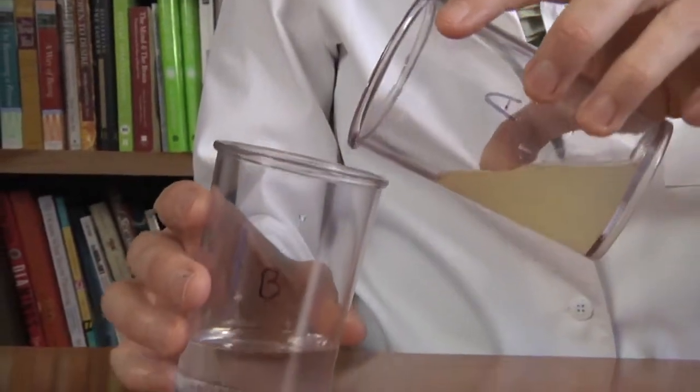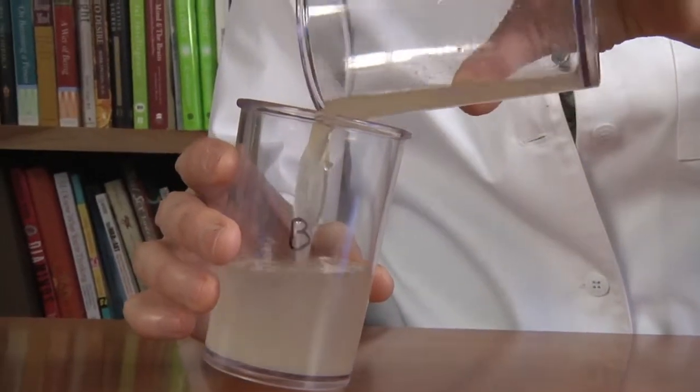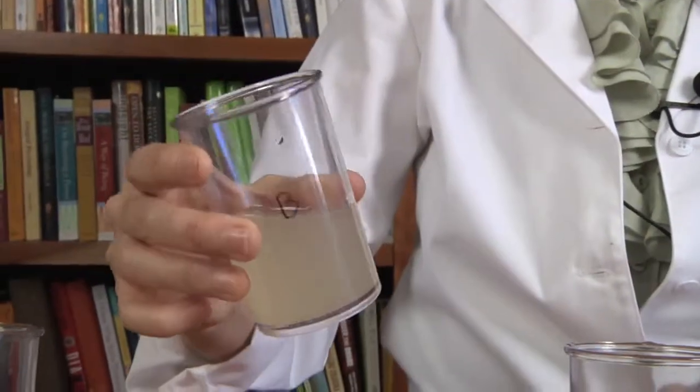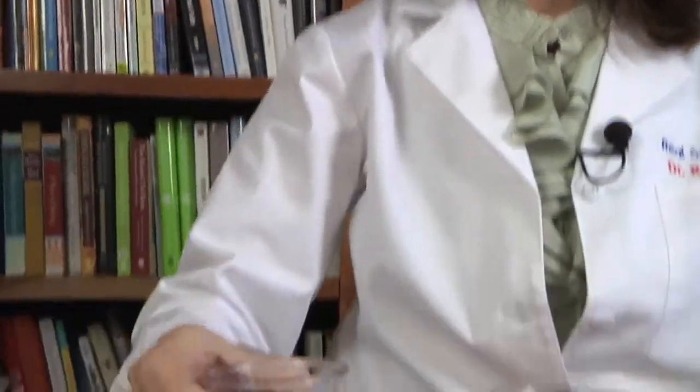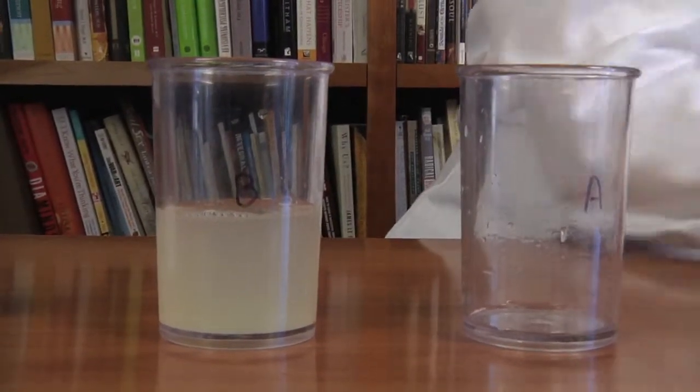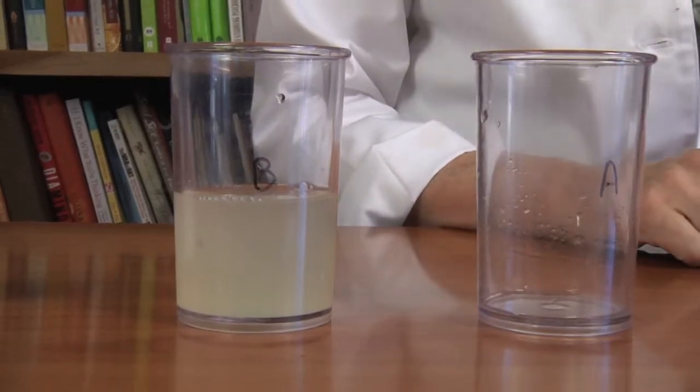I'm going to add A to B. And sure enough, nothing happened. There's no bubbling. It looks like it just got diluted — the material that was in there — really not very much happened. So I'm going to write that down in my notebook. Nothing really happened when I added A to B.